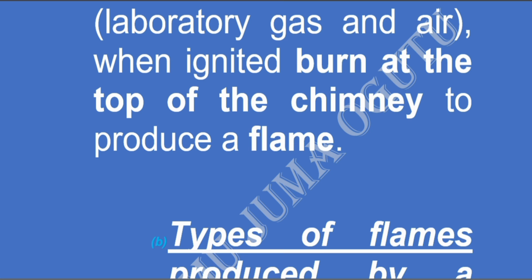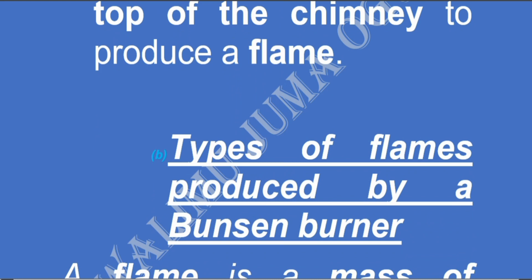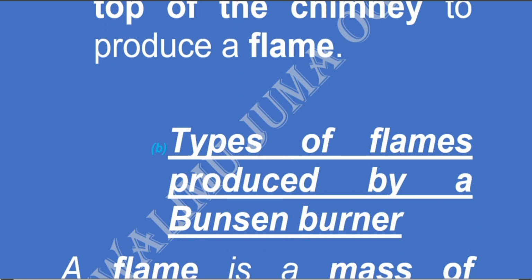Depending on the way that you have opened the collar, we have different types of flames that are produced. So, types of flame produced by a Bunsen burner.